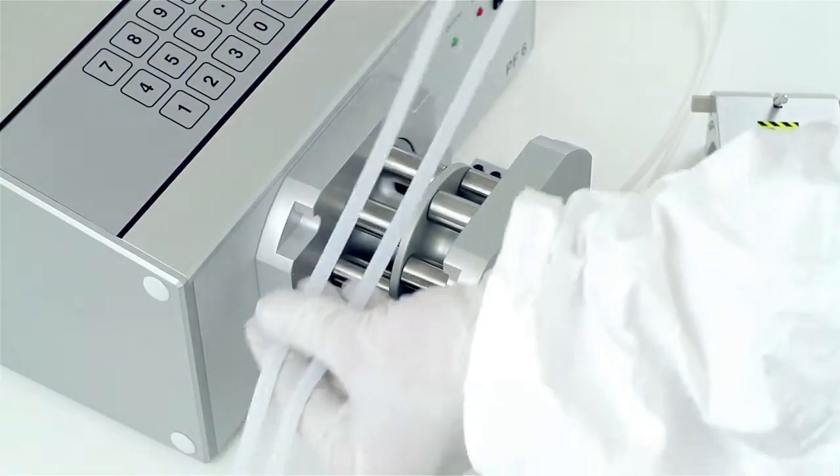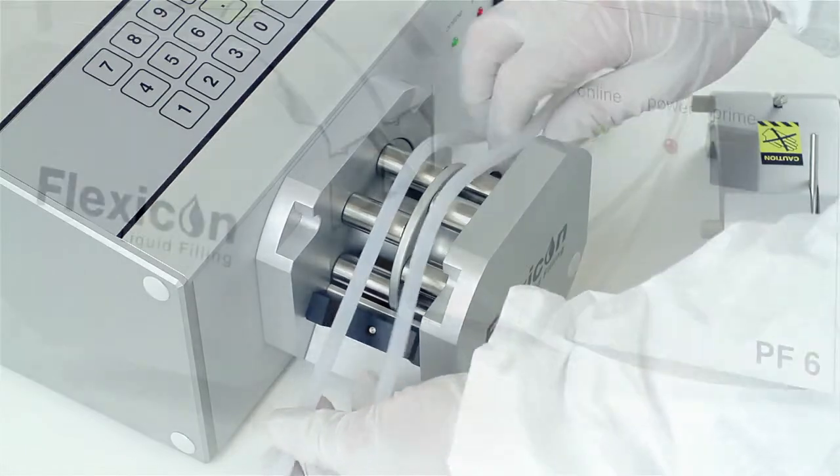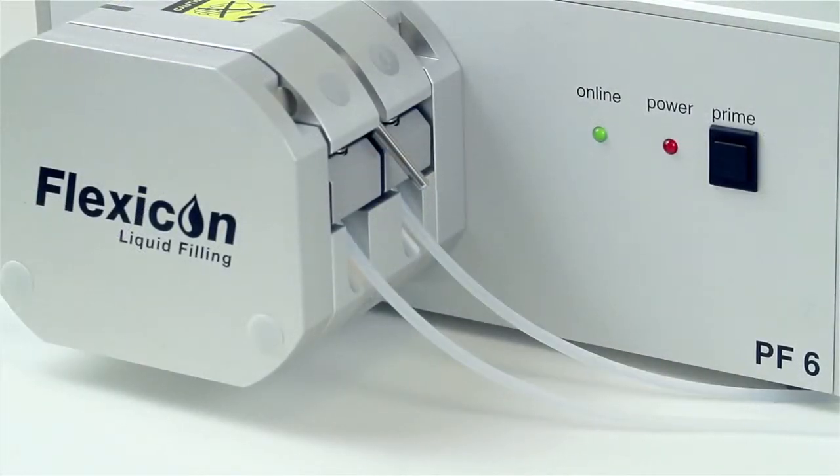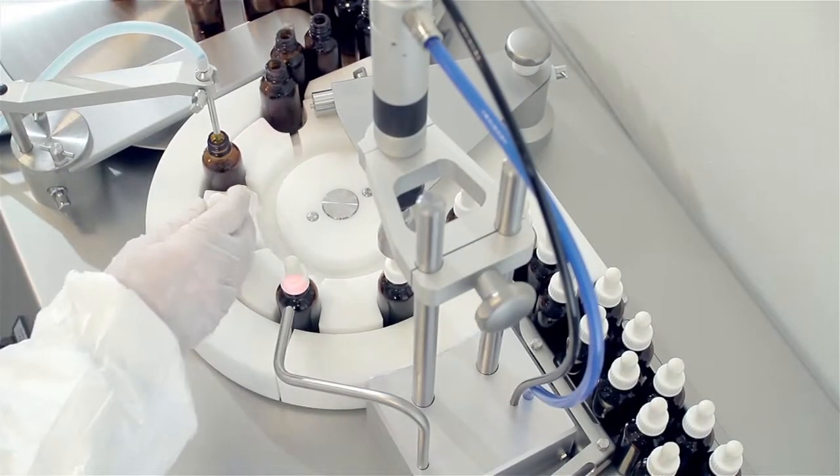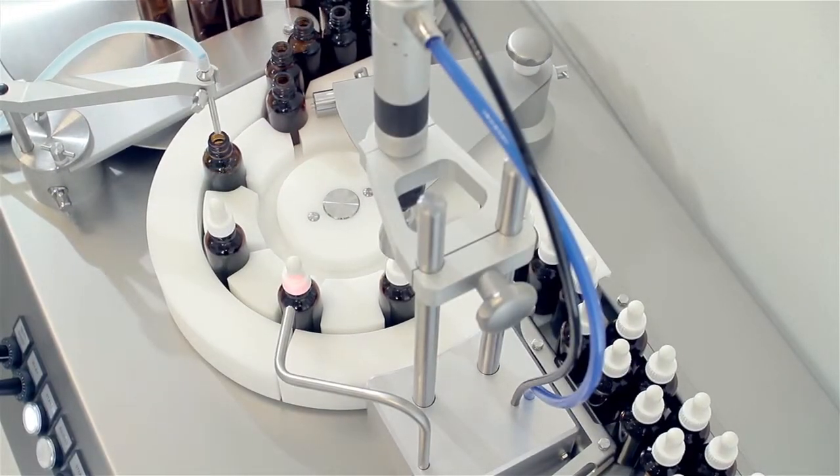The closed fluid path removes the risk of cross-contamination, making the PF6 ideal for contract filling, filling for clinical trials, or a production environment where many types of liquids need to be filled in various batch sizes.